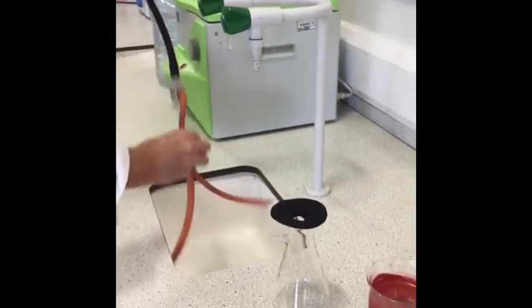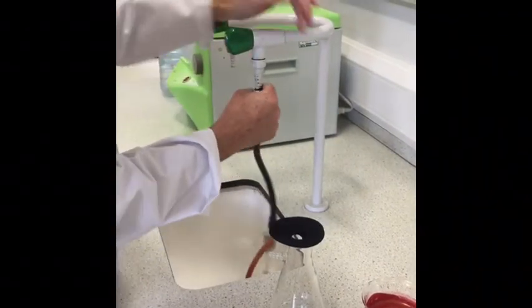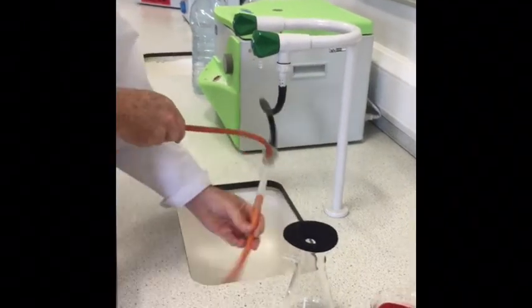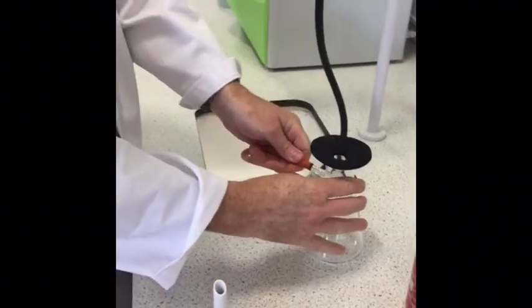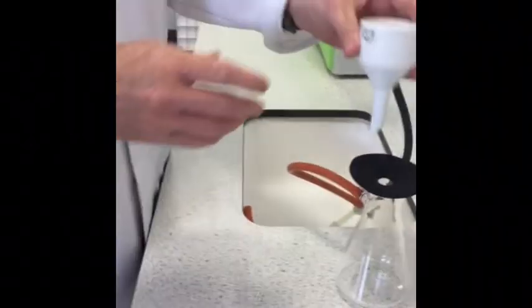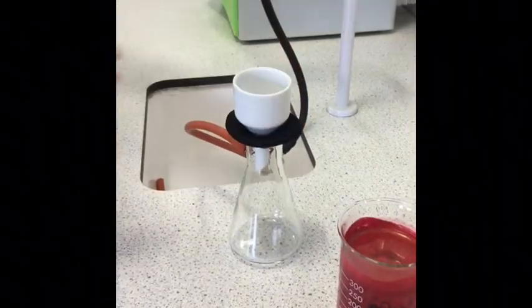So let's set this up. Put this on quite tightly. Okay. Make sure the bottom of it's in the sink and attach the side arm to the Buchner flask. Okay. Then put the Buchner funnel with the filter paper in there.